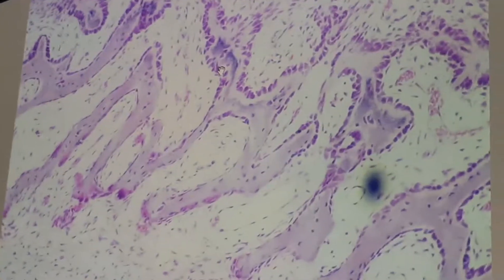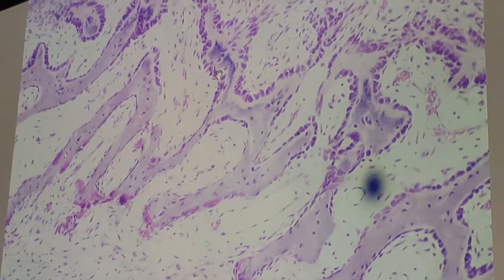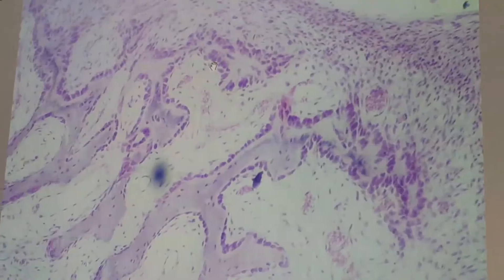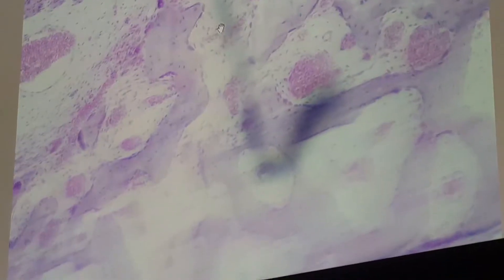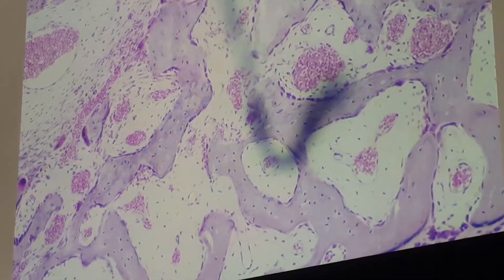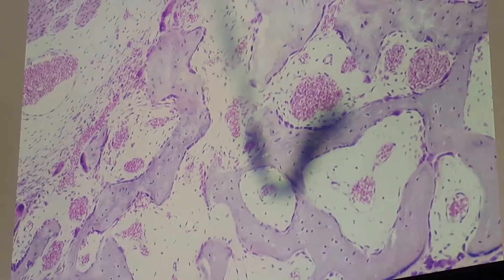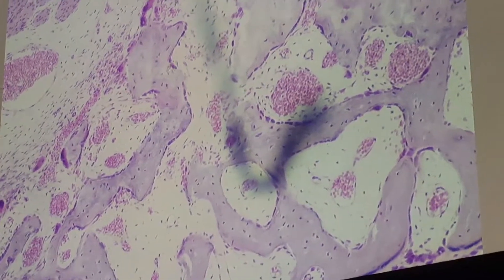Intramembranous ossification is responsible for the formation of flat bones, taking place within a condensation of mesenchymal tissue. This primary bone tissue appears as a spicule.